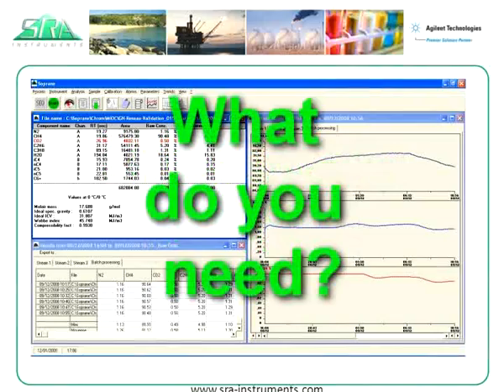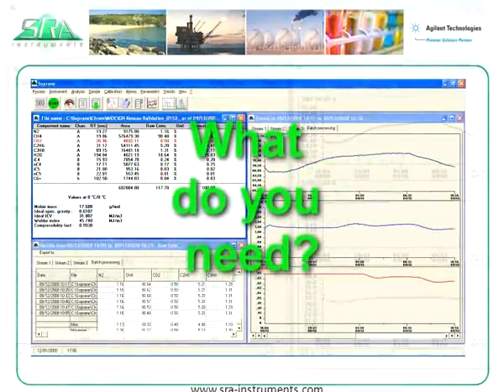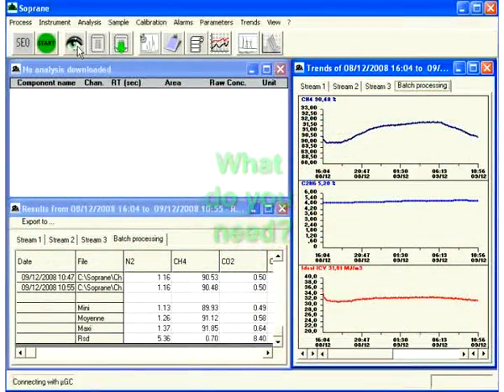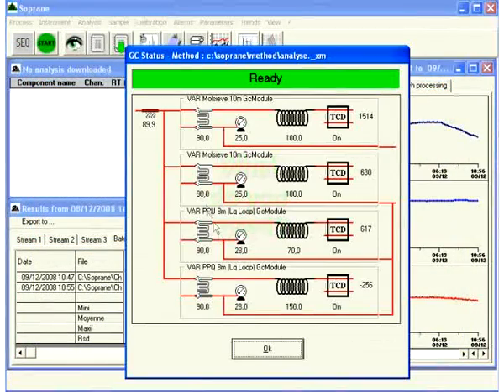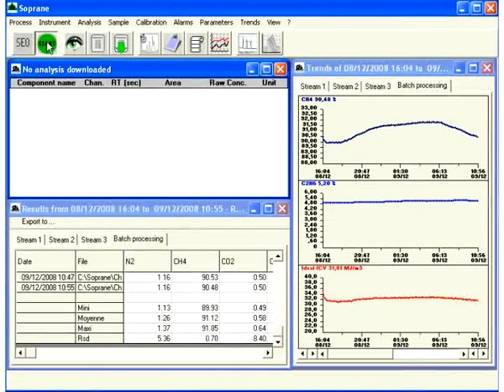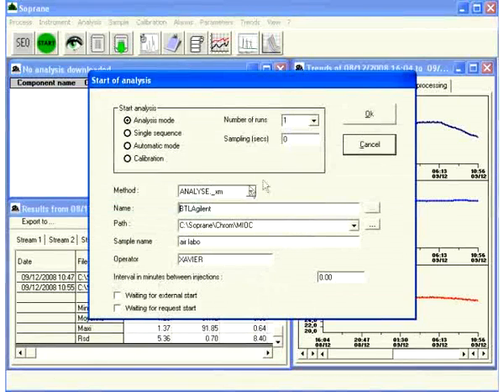What you will need in a complete analysis software solution are the following: detect automatically the GC configuration, be able to run an analysis with two clicks.